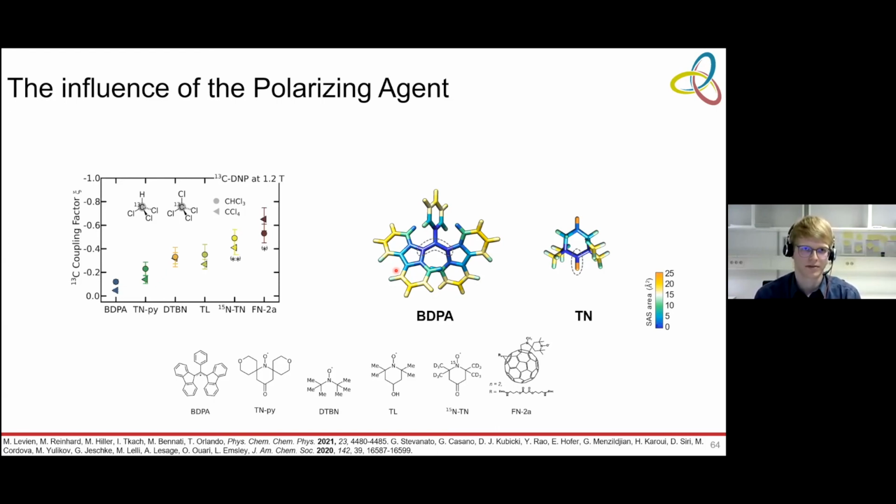And for the second part, the accessibility, of course there will be problems when you want to hyperpolarize the core of the protein. I agree with that, but still you can easily reach the outside and then use correlation spectroscopy to get your signals further.